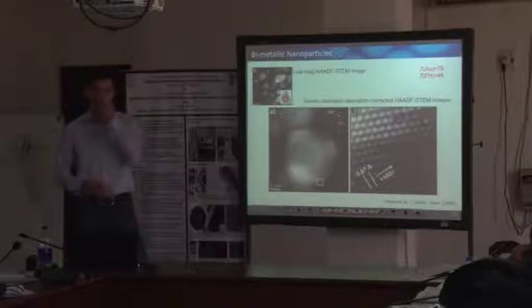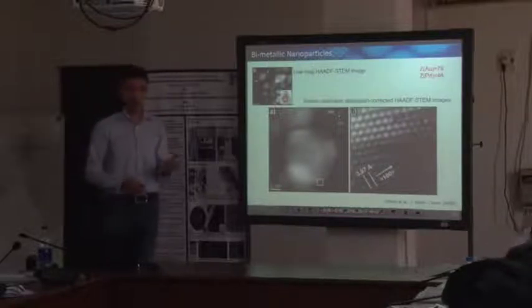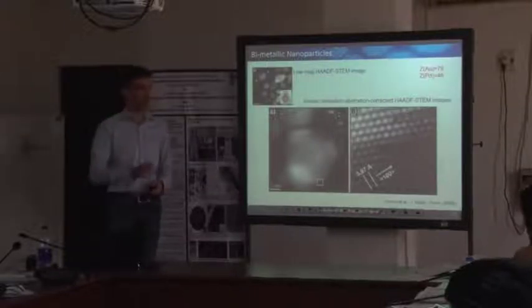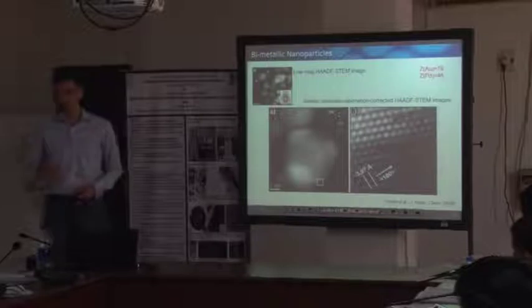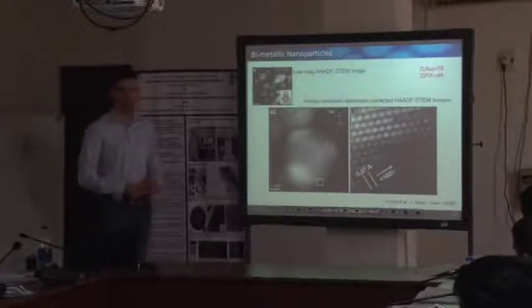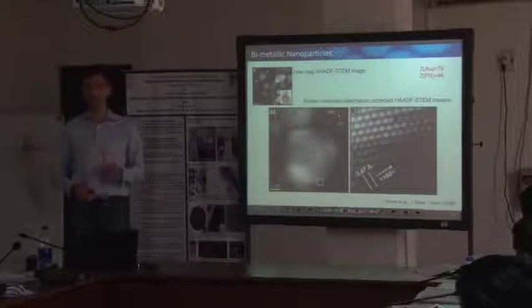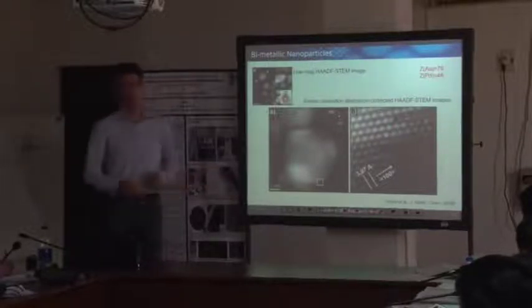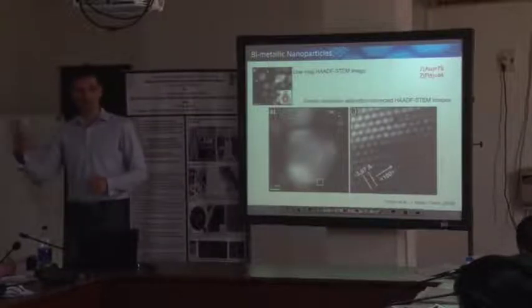So modern simulation tools, and I went through the internet yesterday to compile a list for you, which we are going to send on Thursday, about free software tools to do TEM and STEM simulations. In principle, it has become state of the art to do a chemical analysis on the basis of images. So you don't need an EELS measurement or an EDS measurement anymore.